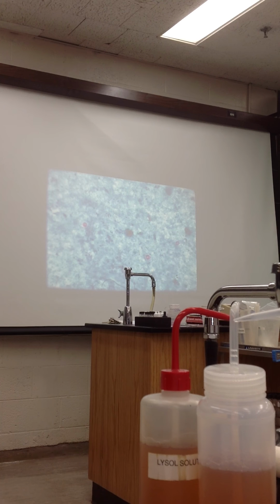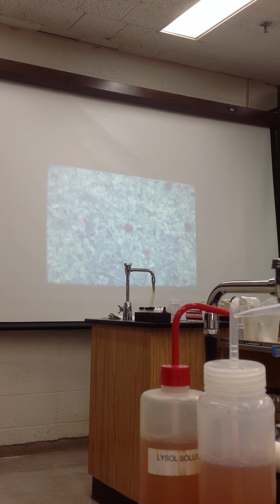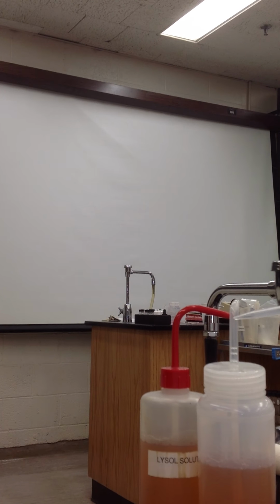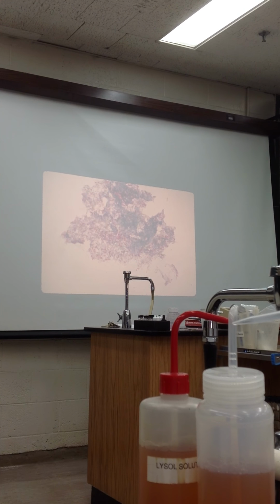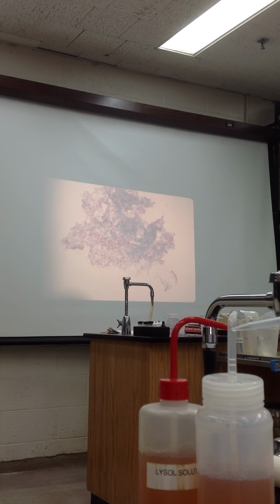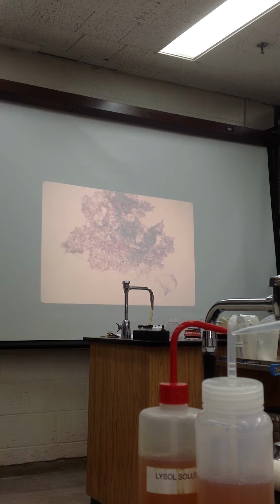In other words, it's round, not like when we do the acid-fast stain and we're looking for a bacilla. In other words, this is where we're looking for an acid-fast bacilla. If we do a close-up, you will see the red organisms.